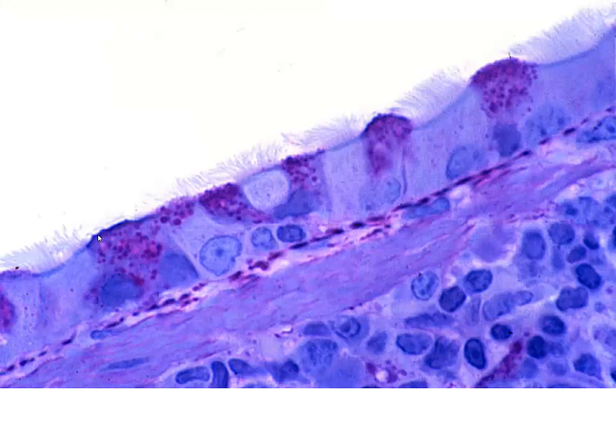A little bit closer magnification as we're getting toward the end. We still have our ciliated cells, and we can see them on the surface. You see they're not as tall, somewhat pseudo-stratified. We still have our basal cells, we still have our apical cells, and we can see our granules being released here, the mucus, but it's much shorter than what we're accustomed to seeing. Here we can see our smooth muscle running beneath. So this is still our respiratory type of epithelium.